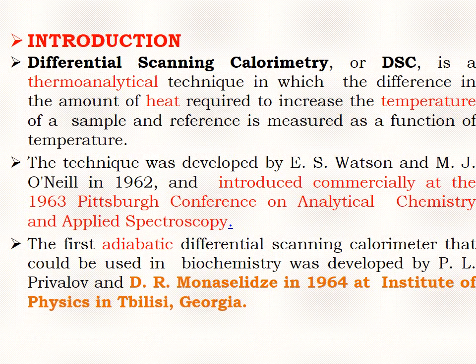That heat will go and do some work within the sample, and we will measure the difference between them. Mostly we can find out the denaturing properties of proteins, biochemical products or biopharmaceutical products, and also the melting temperature. This DSC will provide a relative measure of heat flow and also the molecular motion within the component. This will ultimately determine the heat capacity.